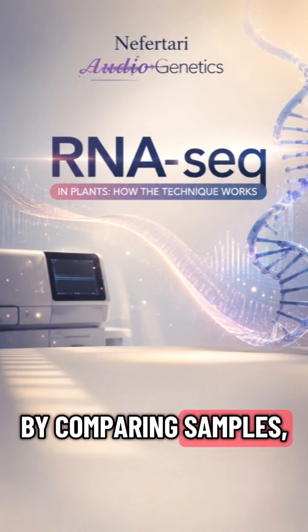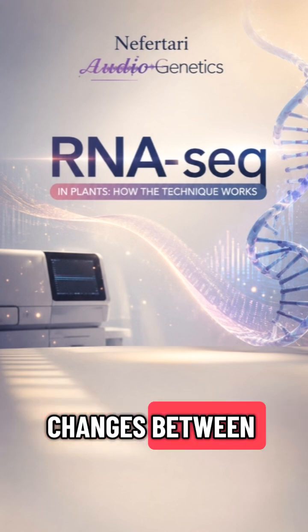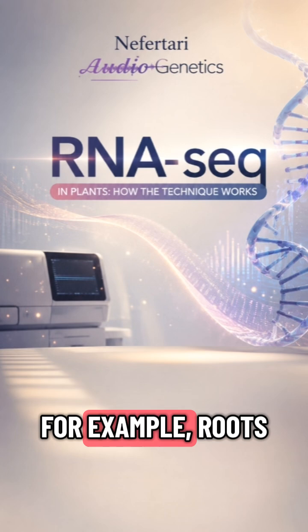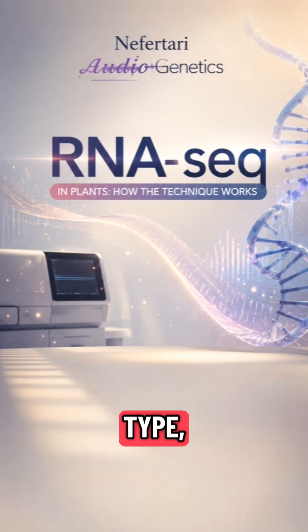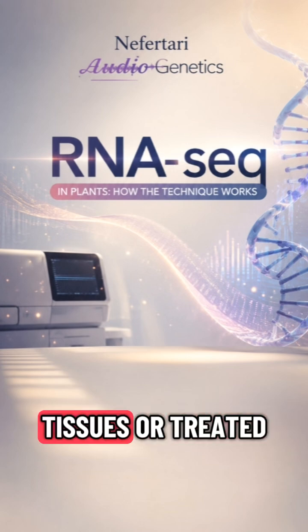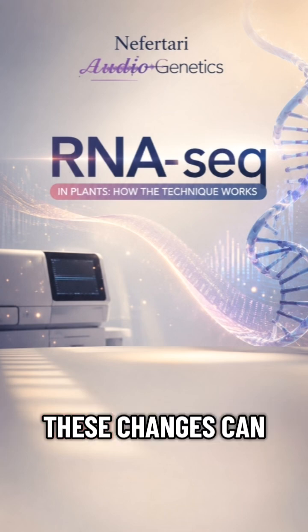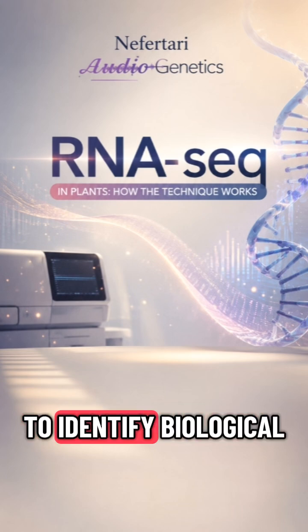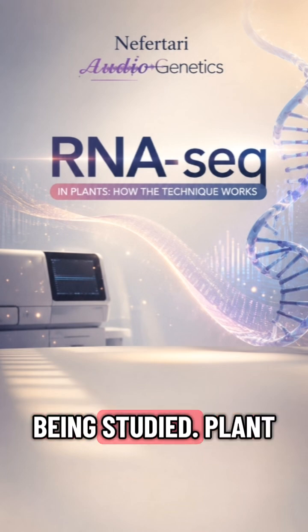By comparing samples, scientists can identify genes whose expression changes between conditions. For example, roots versus leaves, mutants versus wild type, young versus mature tissues, or treated versus untreated plants. These changes can then be analyzed to identify biological processes and pathways associated with the condition being studied.